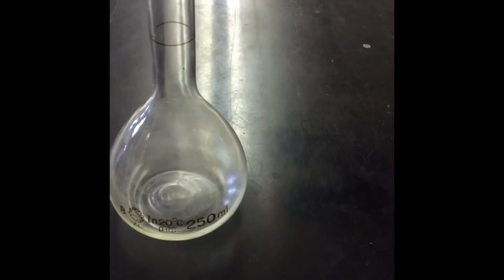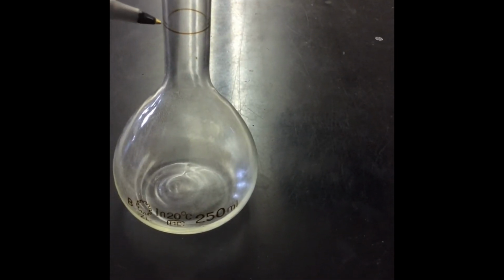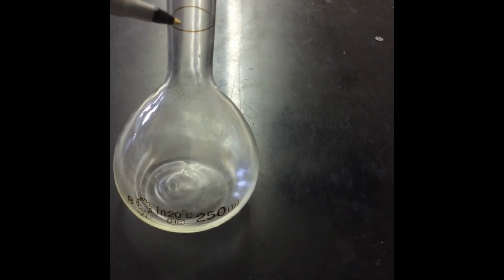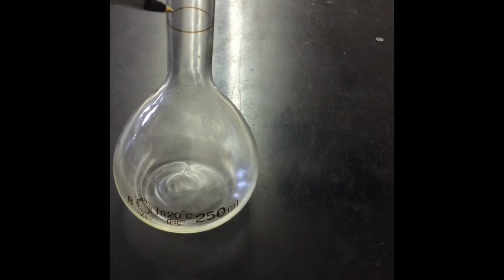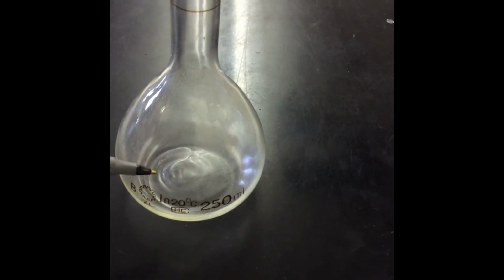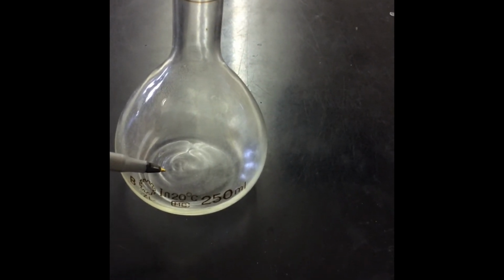So I always dump in the solid first, because if you want the meniscus to go up to this line, if you put the liquid in up to that line and then dump in the sugar, it is going to displace some of that liquid, and the meniscus is now going to go above the line, which we don't want. We want that meniscus right on the line. So you have to calculate how many grams, and I'll help you with that in a minute, how many grams of sugar go into this volumetric flask.